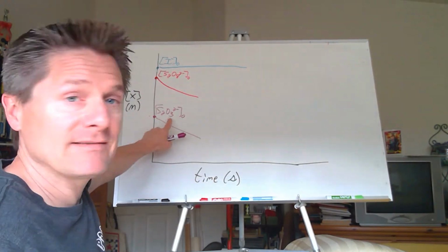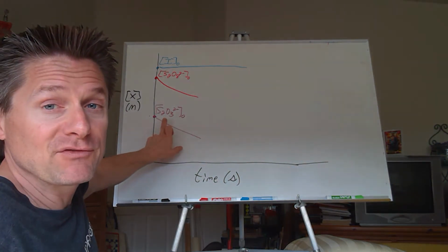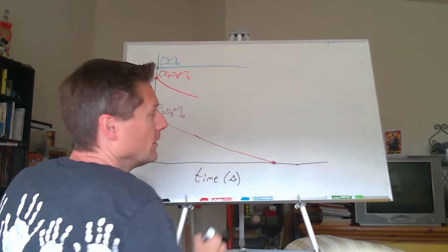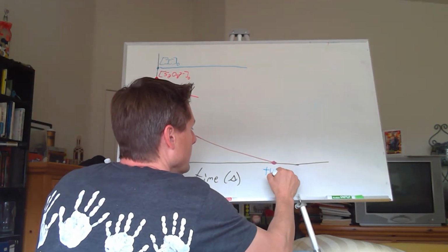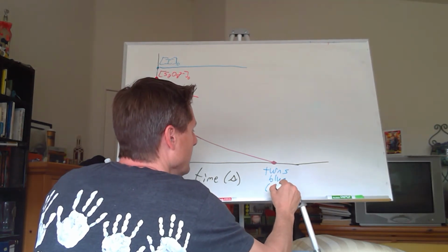As long as this is present. But because we're making a lower initial concentration of the thiosulfate and the peroxydisulfate, this will go to 0 first, and that's when it turns blue. And we're going to call that T final.